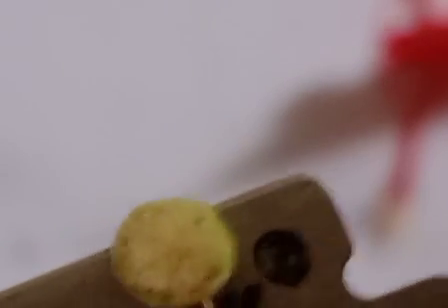So the ovules are there. You can have it here, the ovules. Let me just increase it a bit so that it is made clear to you. Okay, so you can see the ovules. The ones over here are the ovules. So here you have the ovules, you see. These are your ovules. Okay, centrally lobed. Okay, so now we will be going ahead and drawing the floral formula.